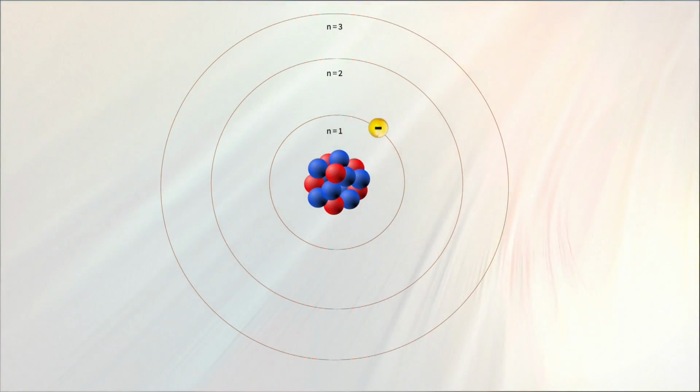Now, what is important is not how that heat is created, but why we heat it in the first place. To know why we burn those nutrients at such intense levels, we have to remember what we learned in high school about the structure of an atom. So remember the atom. It has a nucleus in the middle, and then there are electrons orbiting that nucleus. And each different element will usually have a different number of electrons. And those electrons are going to orbit at a natural distance from the nucleus.